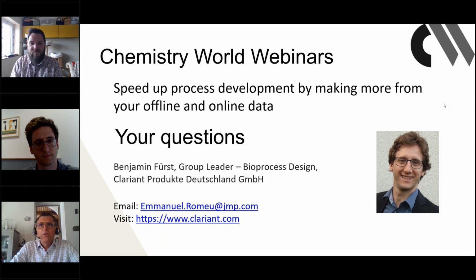That, I would say, is the very first step. Visualization is highly critical to ensure the sanity of your data. Is there any outlier? Does the data make sense? Does the relationship make sense? And then start understanding the relationships between the various variables.